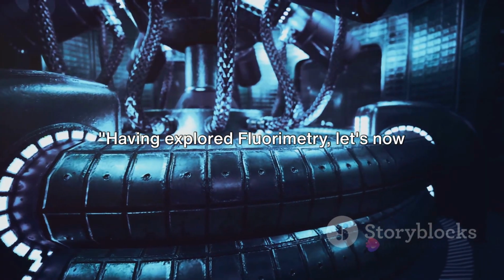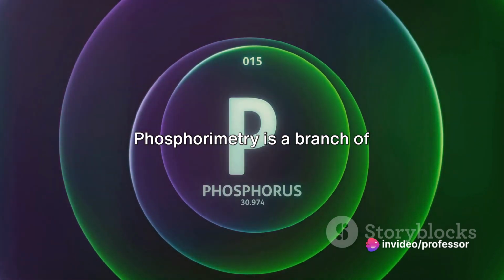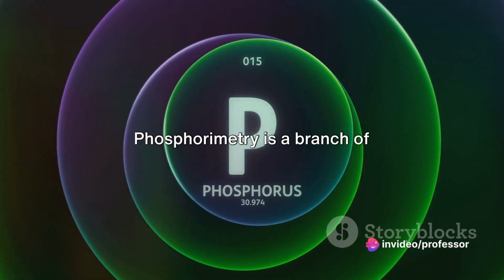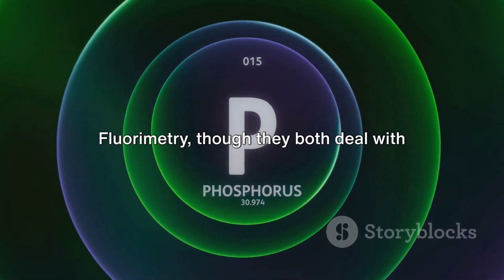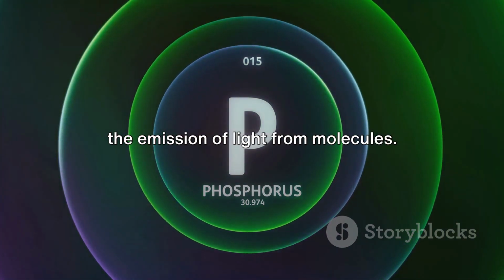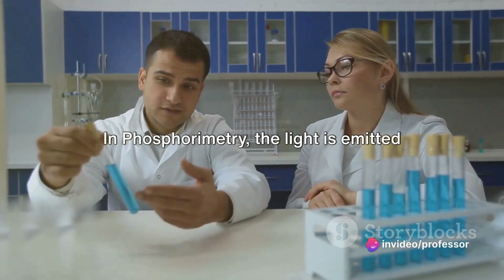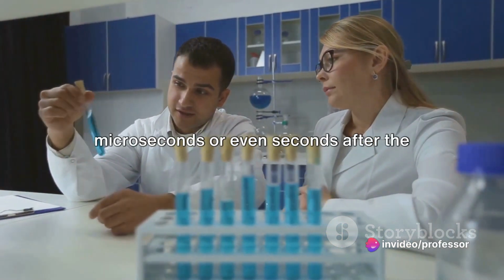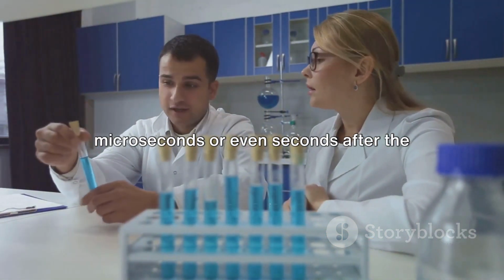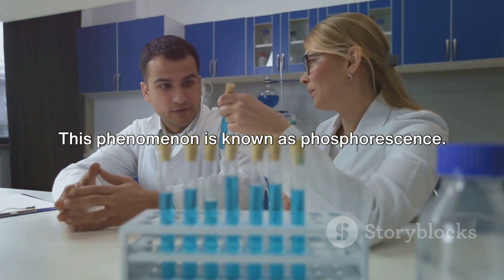Having explored fluorimetry, let's now turn our attention to phosphorimetry. Phosphorimetry is a branch of luminescence spectroscopy, distinct from fluorimetry, though they both deal with the emission of light from molecules. The key difference lies in the time taken for the emission of light. In phosphorimetry, the light is emitted after a noticeable delay, often microseconds or even seconds after the molecule has absorbed energy. This phenomenon is known as phosphorescence.